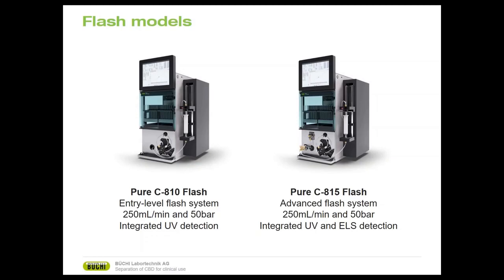ELSD is used for the detection of non-UV absorbing materials, and terpenes are considered non-UV absorbing materials. You cannot see the terpenes under the UV, but you can see them under the ELSD.